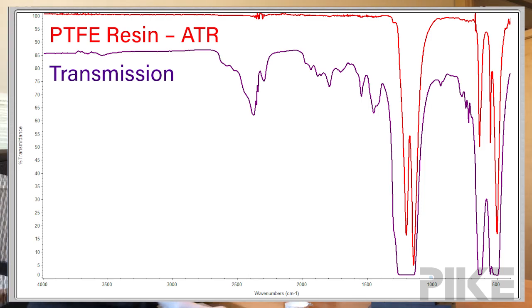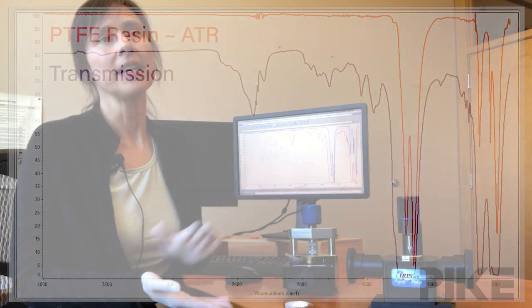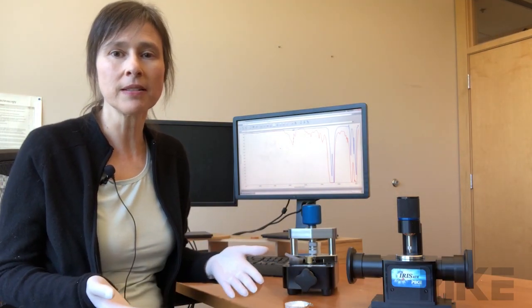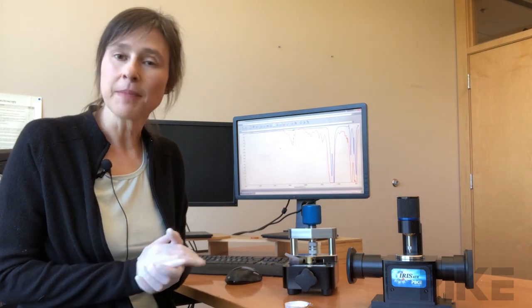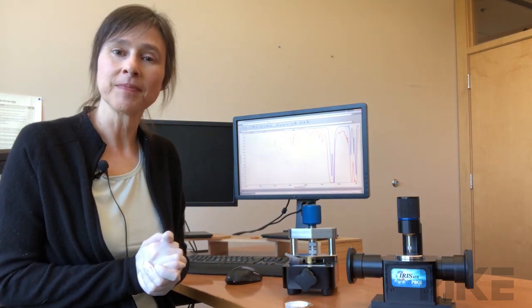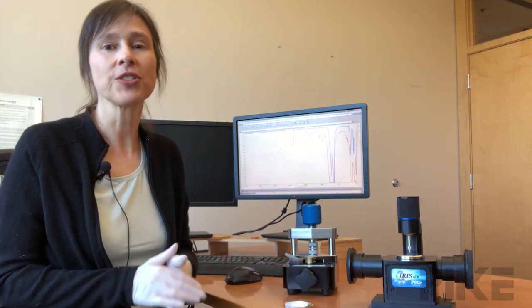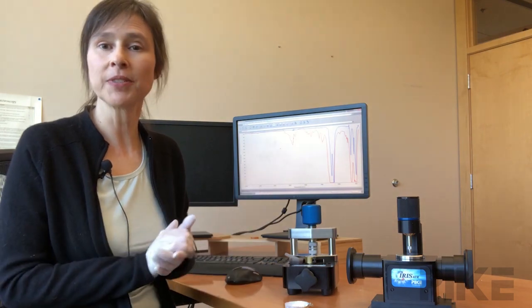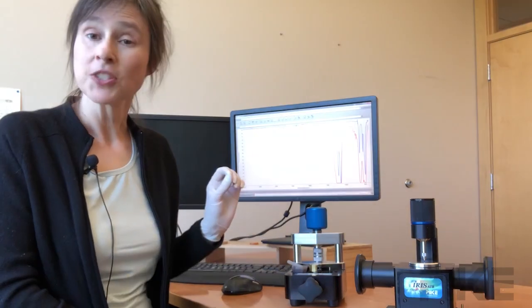So what these results would tell me is if you're looking for contamination or a small component within the resin, I would definitely make a film over ATR. If you're just looking to identify that it's Teflon, ATR is perfectly fine.